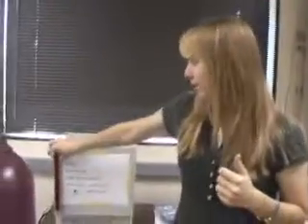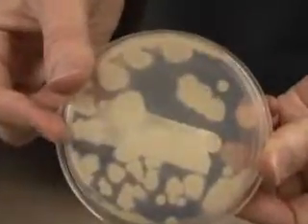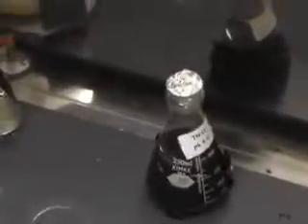This is the incubator where we keep our microbes. Here is what they look like when they're growing. You can see they're not very pleasant looking, but this is what we like to see. Once we get our microbes, we put them into a fermentation, and the small flasks are the ones that have the wood molasses in them. We add microbes to the wood molasses, and they sit there for about 5 days, and each day we take samples to run ethanol and sugar tests. Once we've taken the samples, we have to find out how much ethanol is in it each day and what sugars are being consumed, because there's all kinds of different sugars inside of it, and some microbes prefer some sugars over others, and we want to make sure that they're all being consumed.